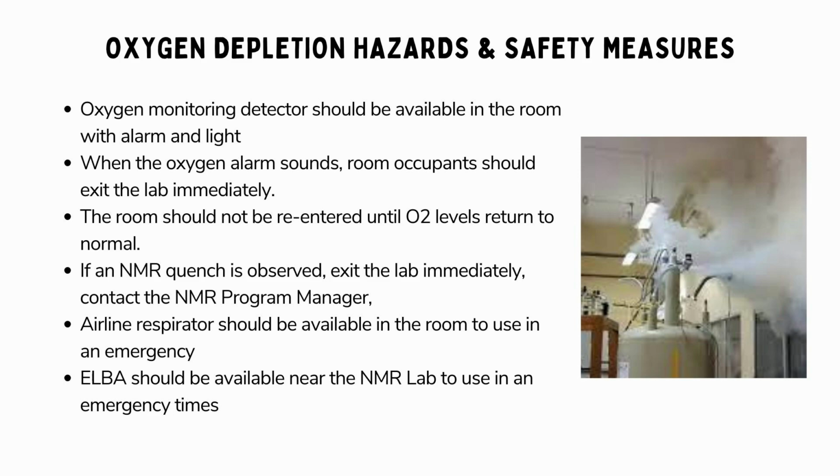In the event of an NMR quench, vacate the lab without delay and promptly notify the NMR program manager. An airline respirator must be readily available in the room for use during emergencies. Emergency life breathing apparatus, ELBA, should be accessible near the NMR lab for critical situations.